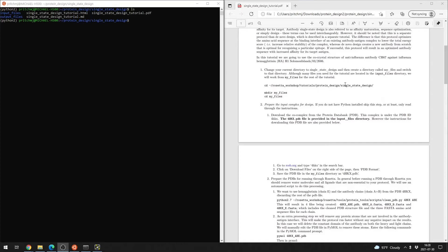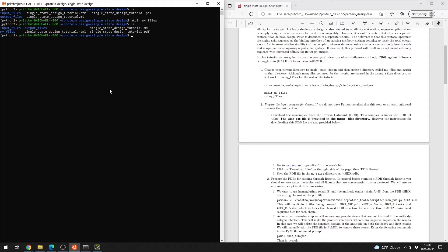Navigate to your single state design folder within your teaching resources, then go ahead and make a new directory — you can call it 'my files' or whatever else you'd like. There are some sample input and output files we'll be using for the tutorial, but almost all of those can be generated just by executing the tutorial.